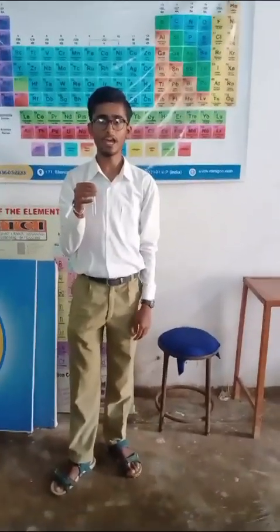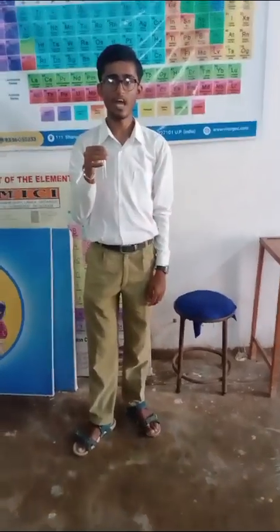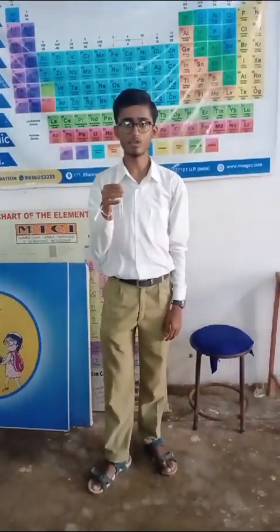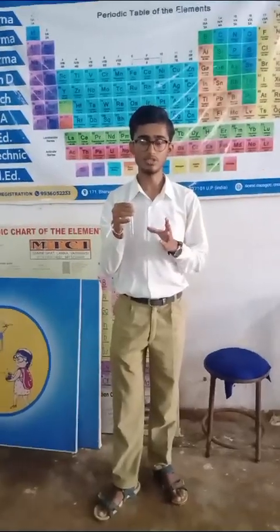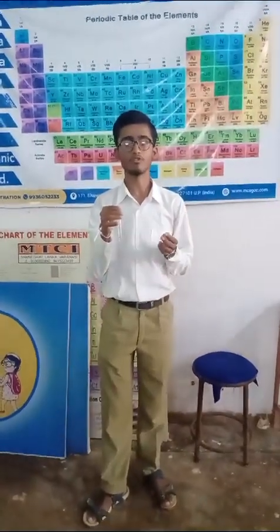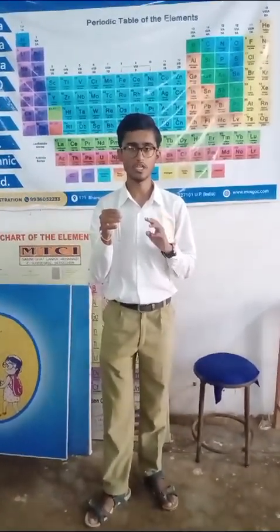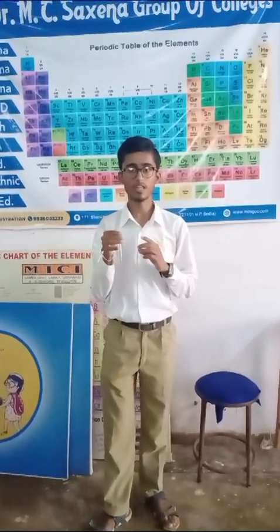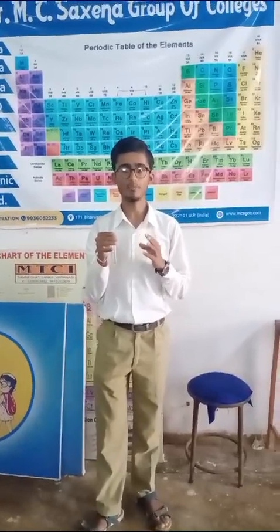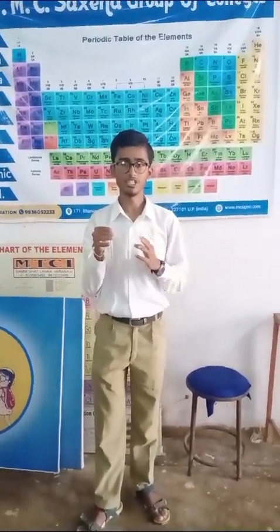Today I am going to explain the brown ring test of ammonium nitrate. For this I took ammonium nitrate salt in a little amount in a test tube and made the original solution with the help of 2 to 2.5 ml of distilled water. Then I took another test tube and made fresh ferrous ammonium sulphate solution with the help of 2 to 2.5 ml of distilled water.